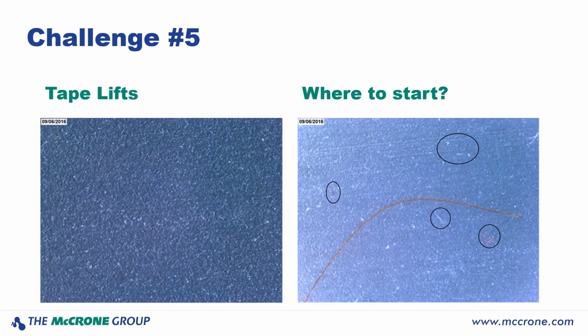Well, unfortunately, this also picks up some things that you're not expecting. If you're looking at the image on the right, I'm assuming the particle of interest here is probably that nice long brown fiber, looks maybe like a hair, but we've found a whole bunch of other things too, this little red fiber and a whitish one and a black particle and little white pieces. I mean, these are probably all common environmental debris, just dust, but we don't know that when we look at the tape, and we have to determine which particle of interest is really there and where the others may have come from or not.